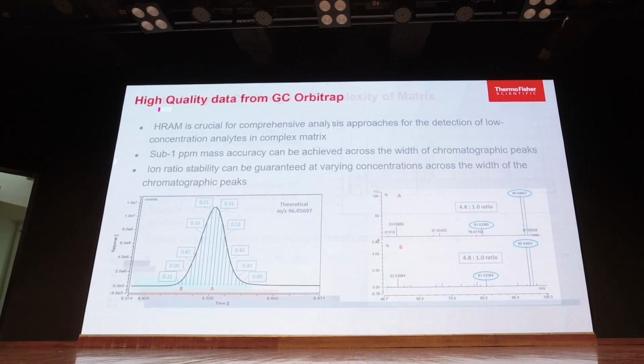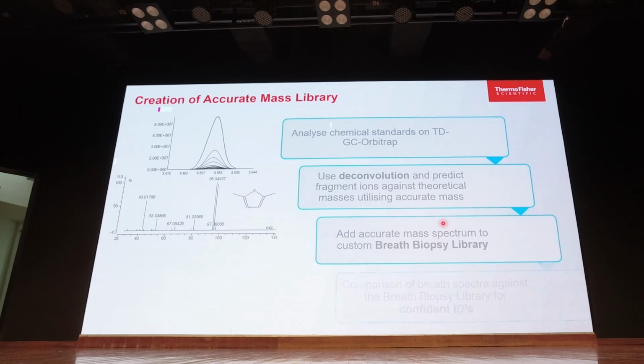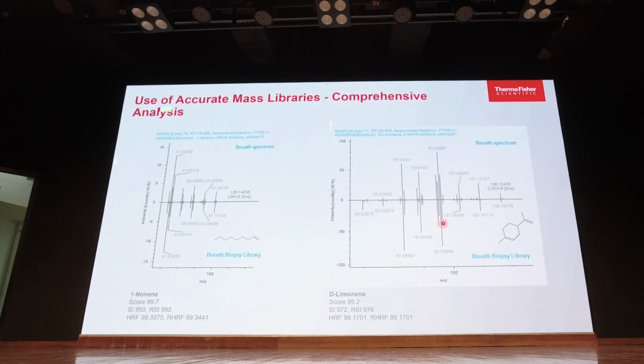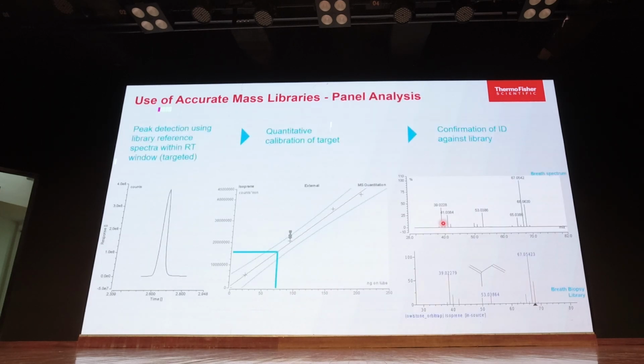With this, I'll conclude because we started with application. We are creating this accurate mass library for different disease biomarkers, and you can predict and quantify.